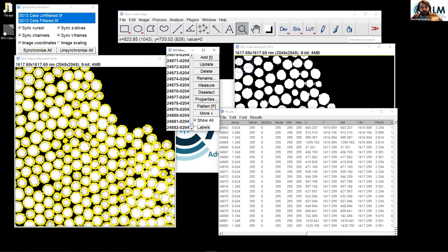So filtering before you actually do these thresholds and these conversions can be extremely important, because a computer doesn't really understand shapes. We as humans have a brain, we can actually understand and can make sense of information, but a computer thinks of zeros and ones. For it, if it's a one, it's an object, so it's going to mark it. It doesn't care about sizes. So how can we reduce this if we don't want to do any filtering?